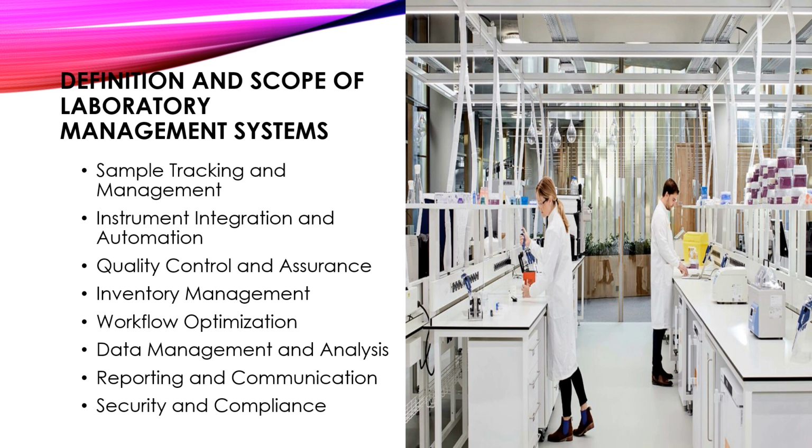Workflow optimization. Lab management system streamlines laboratory workflows by defining and automating task assignments, scheduling, and prioritization. It helps improve efficiency, turnaround times, and resource allocation by eliminating bottlenecks and optimizing resource utilization.